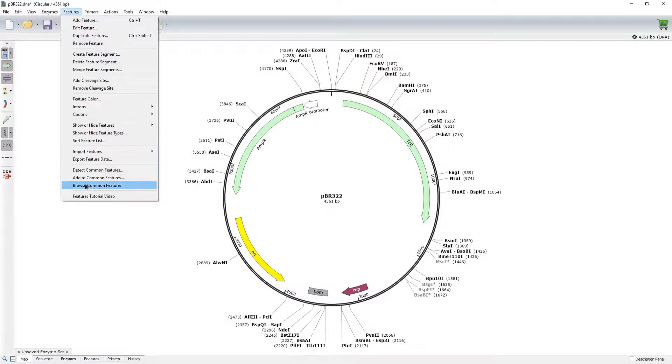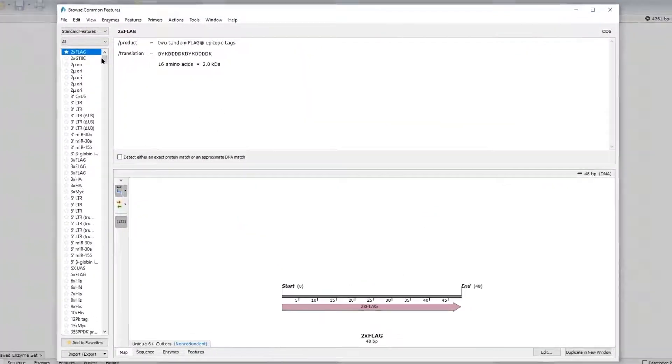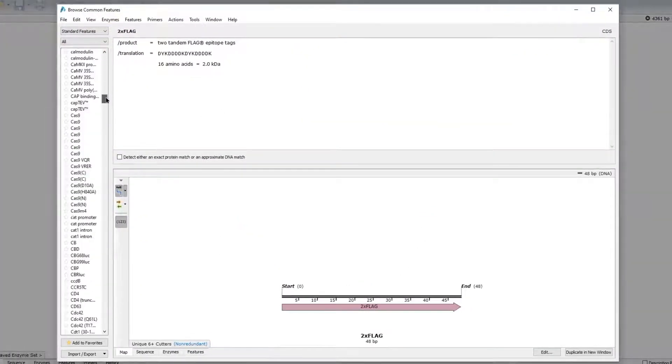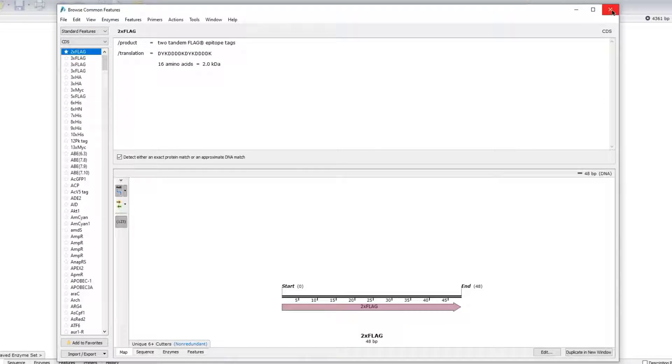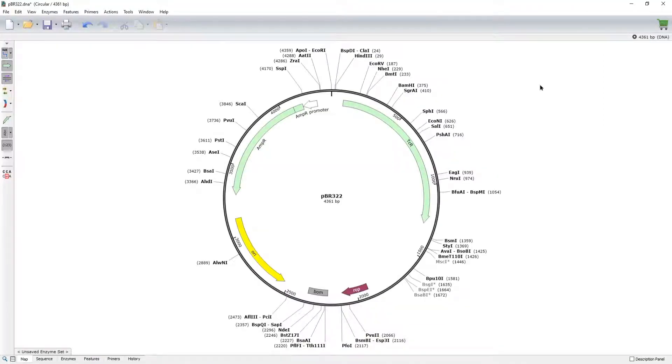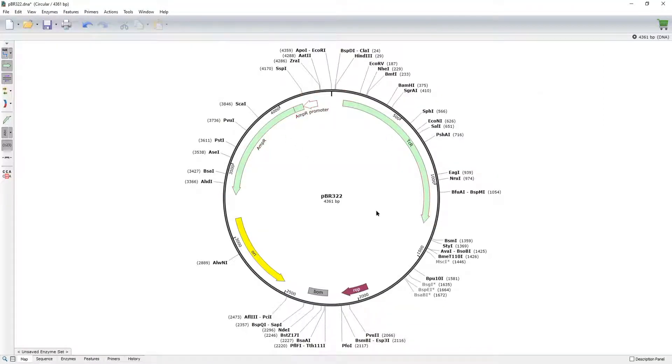SnapGene comes pre-loaded with hundreds of features found on common cloning vectors, and automatically adds relevant features to any new DNA sequence.